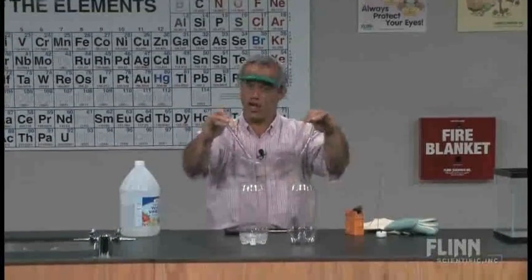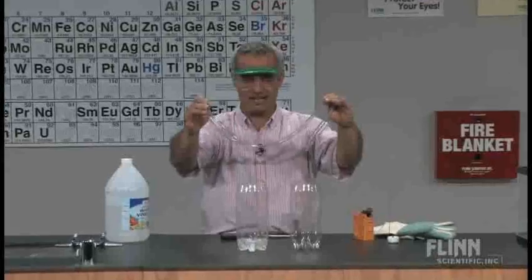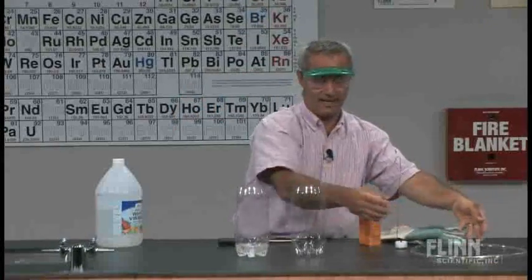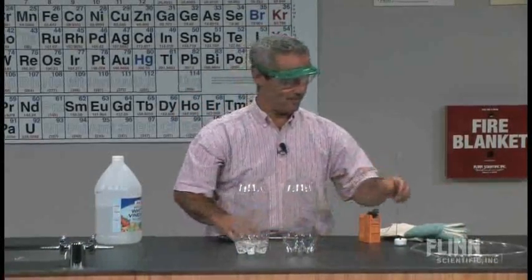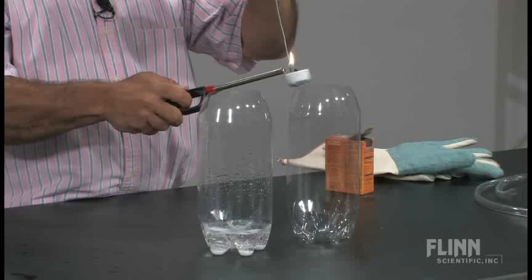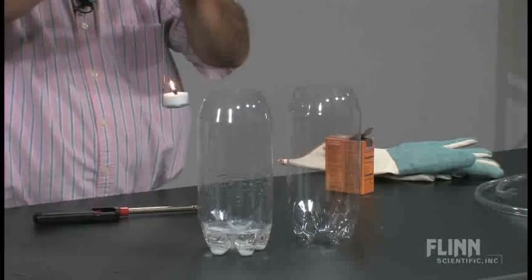That was a little stalling and look I'm doing like this as though something's dripping off of there and I think it is but I can't see it. Was I successful at siphoning the CO2 from one to the next? Let's find out. Okay here we go.